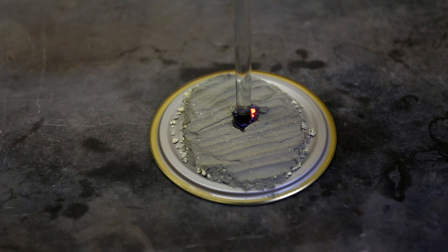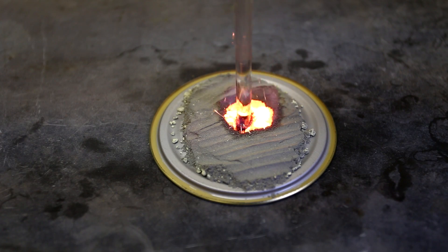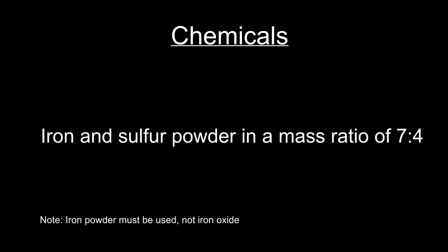Ignited using a hot glass stirring rod, iron powder and sulfur powder react together extremely exothermically. For this experiment, only iron and sulfur powder is needed. The amount you need will depend on how much you want to make. You can make any amount as long as you maintain the mass ratio of 7 grams of iron to 4 grams of sulfur powder.